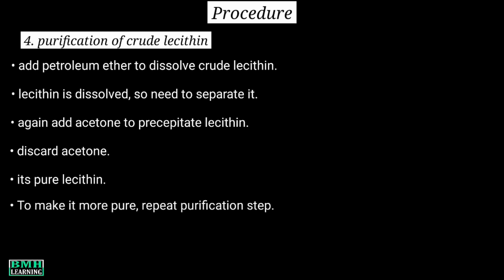To make it more pure, we can repeat the purification step. This was all.